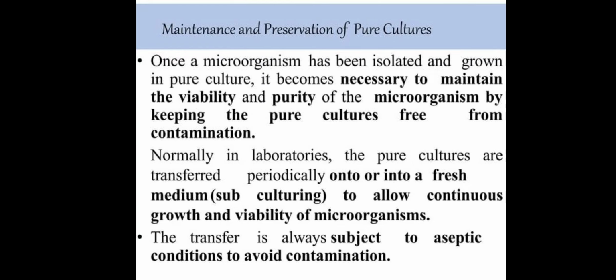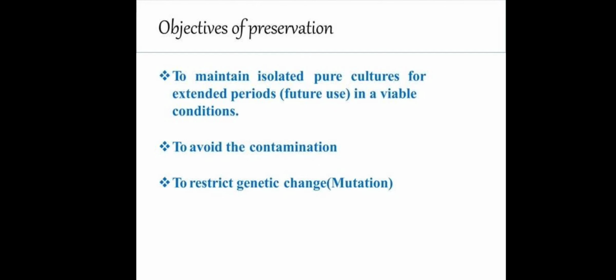Objectives of preservation: to maintain isolated pure cultures for extended periods for future use in viable condition, to avoid contamination, and to restrict genetic changes and mutations.